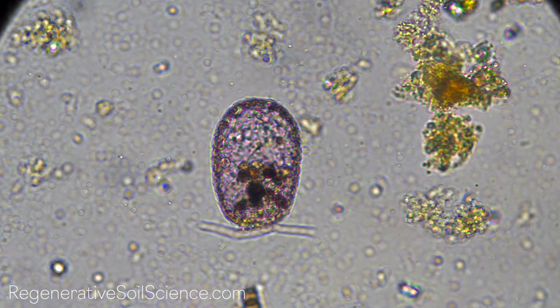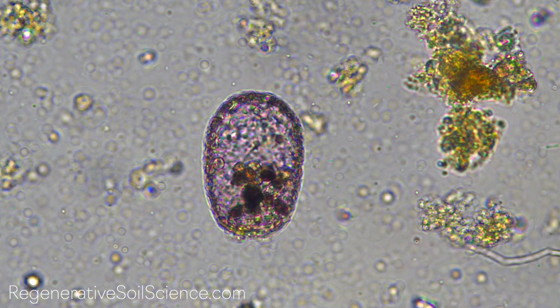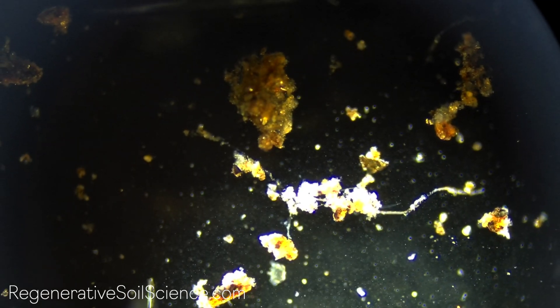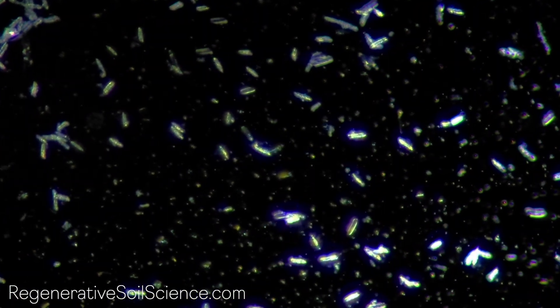This is what the bright field looks like, and it's nothing like what this place really looks like. Soil microbes are never blasted with pure white light like this in their natural settings. Dark field allows us to see a much more colorful take on the microscopic world. We also see more depth, and it reminds most of my students of interstellar space — the cosmos in a drop of soil water. I personally find the dark field world to be utterly beautiful, much more enchanting than bright field, and I must add that epifluorescence has captured my heart as well.